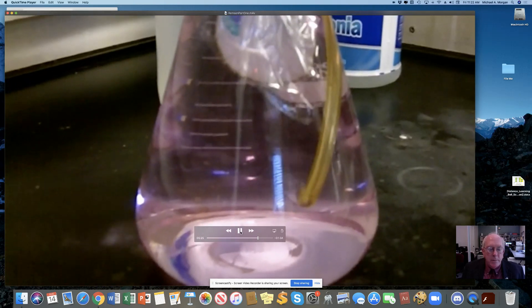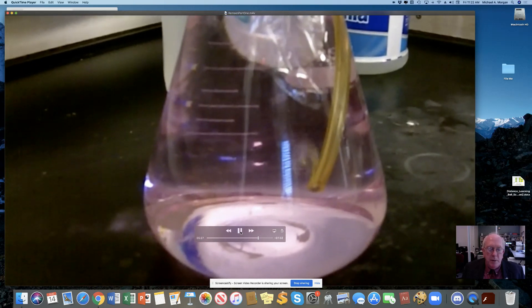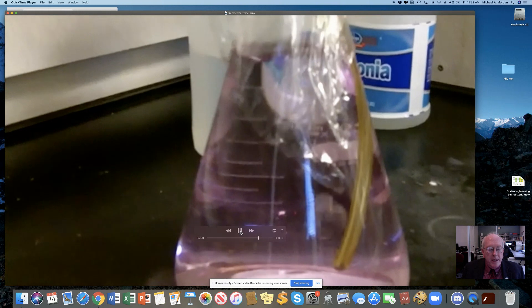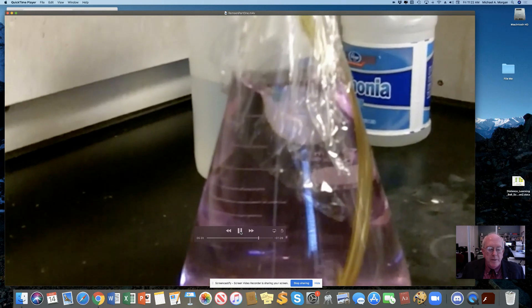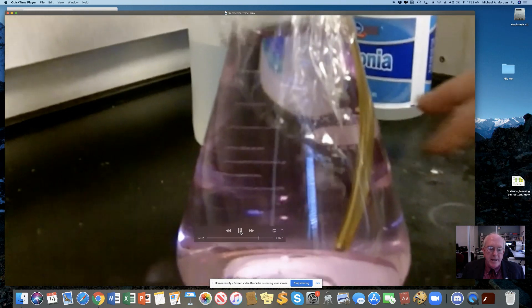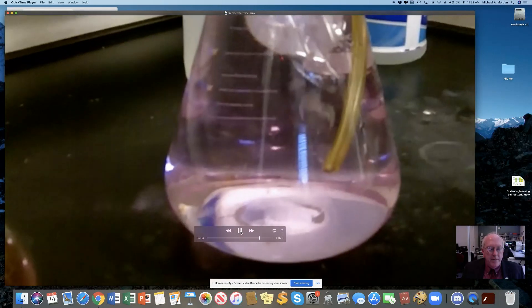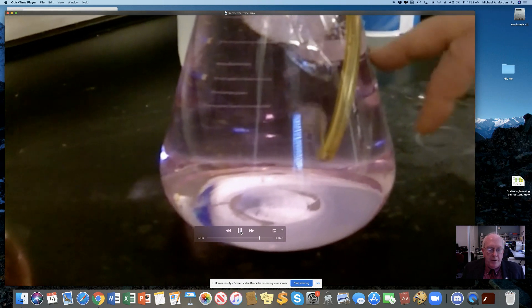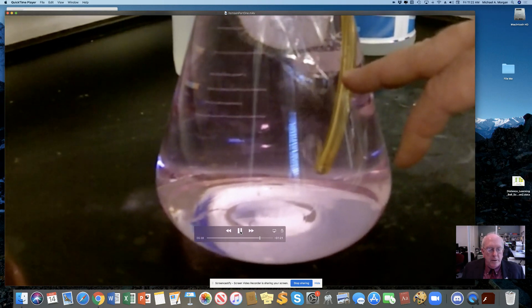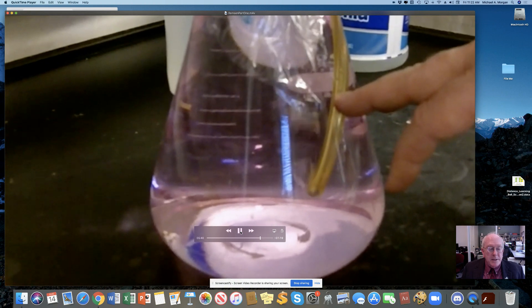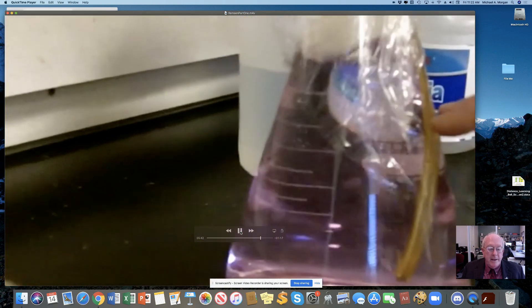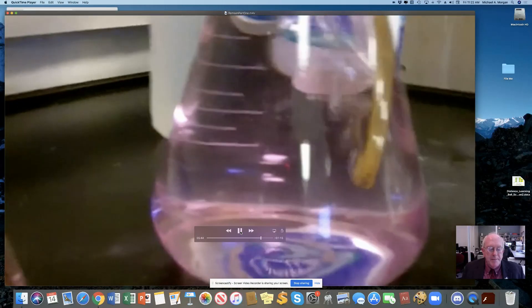The scent was already changed, and it was no small change either. A greenish-blue liquid foamed and fumed over the scent and over the table. The air in the neighborhood of the performance became colored dark red. A great colored cloud arose. This was disagreeable and suffocating. That's why I put it in that sealed system.